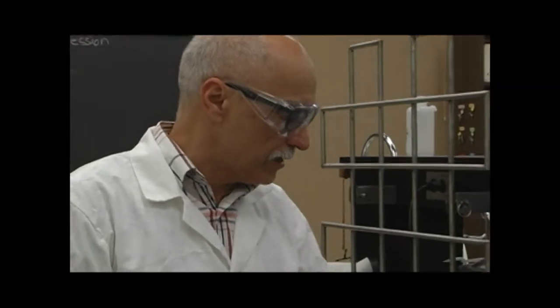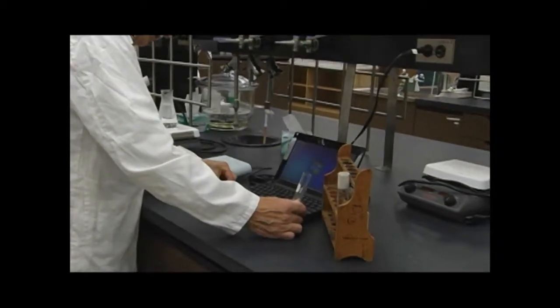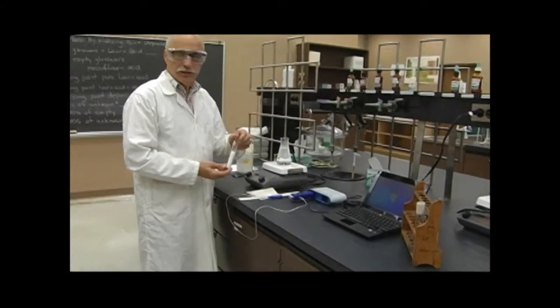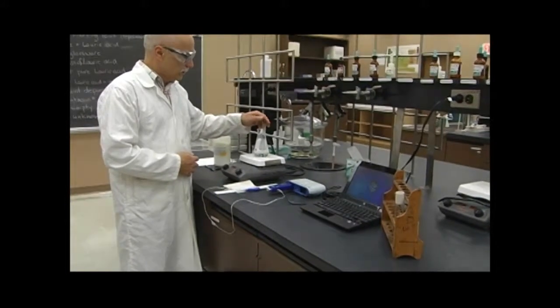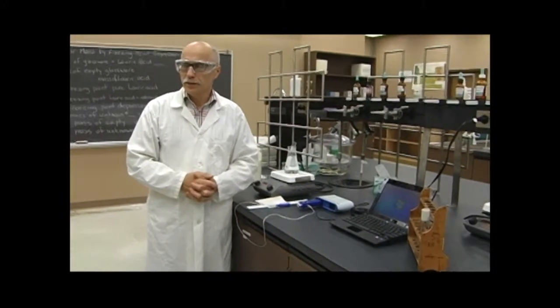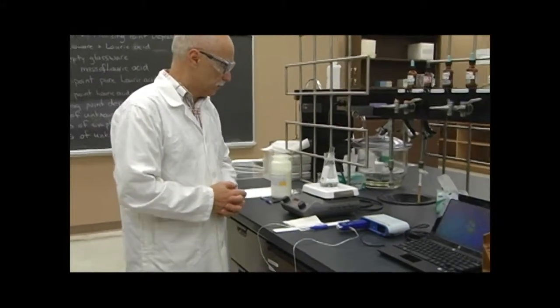Okay, so now that the computer is started up, I can connect the Pasco USB connector so that the application starts up. And while the application starts up, we can put the lauric acid in the hot water so that it'll melt, and then we'll record the freezing curve by the thermometer from the Pasco units.